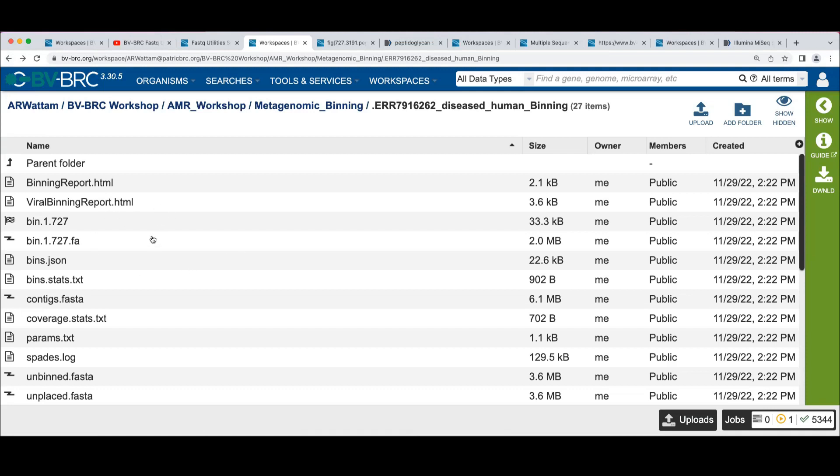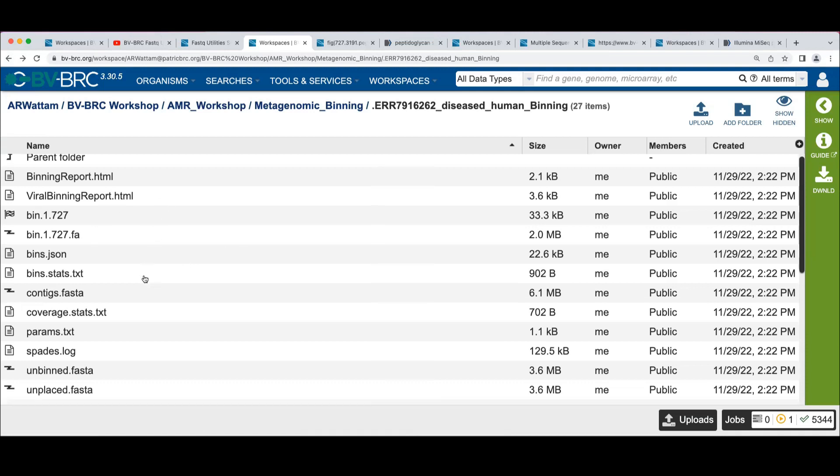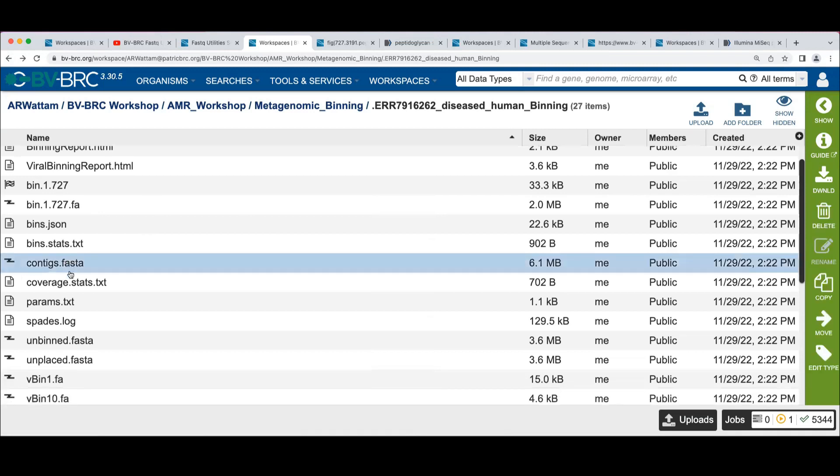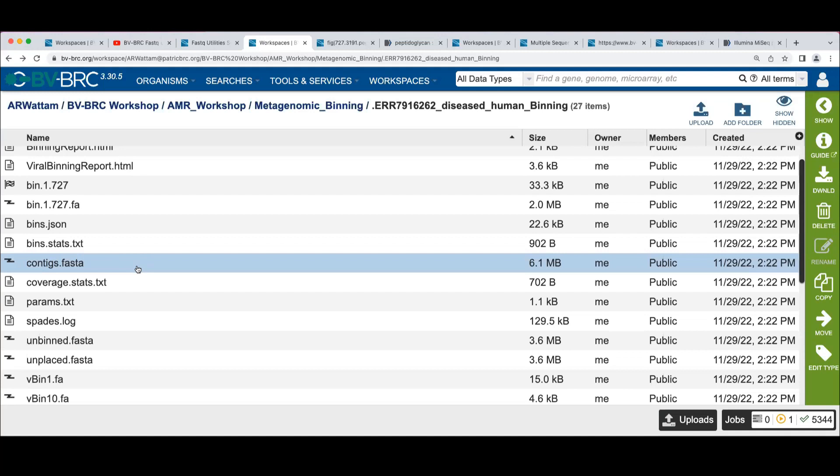And in fact, remember I mentioned that you might want to run the binning a couple of different ways. One of the files that's generated here is this contigs.fasta. This is the output of the assembly run that was used for the binning. So if I wanted to rerun the binning and say, just do the viral binning on this dataset, I wouldn't have to spend the time doing a reassembly.